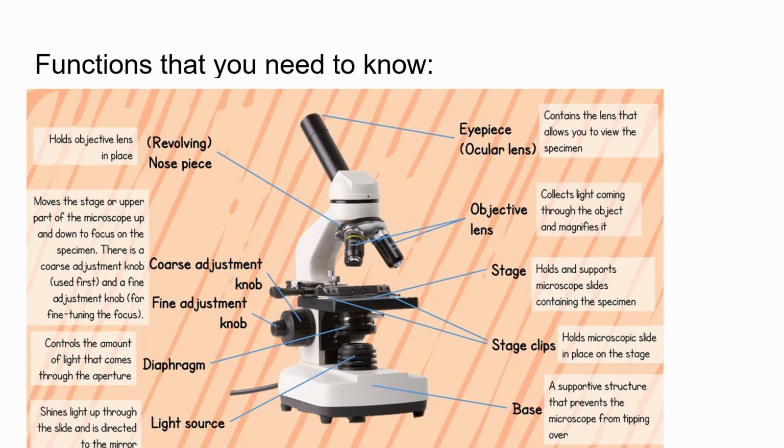You need to know how the microscope works in order to know how to use a microscope. So yeah, you could see the functions and memorize them because they might come up on your exams.